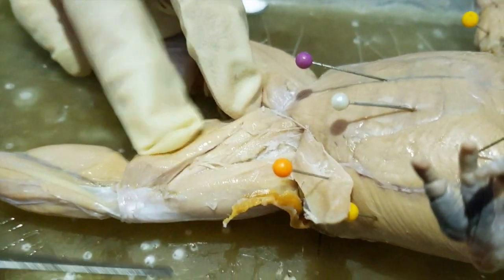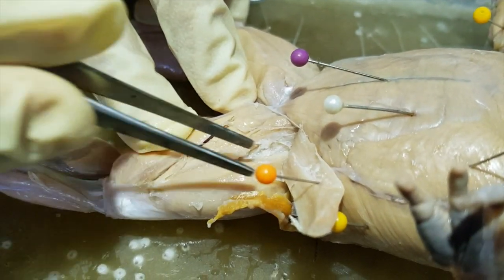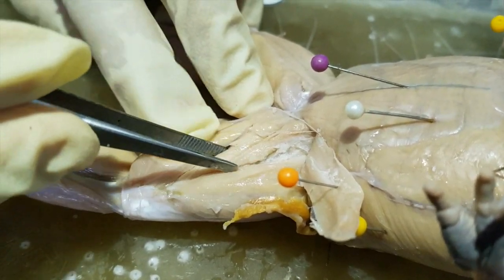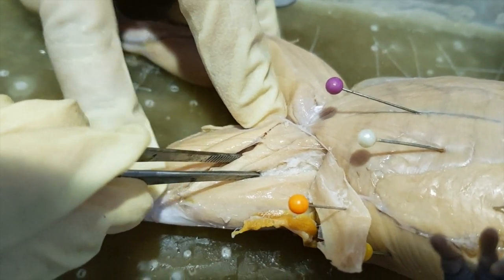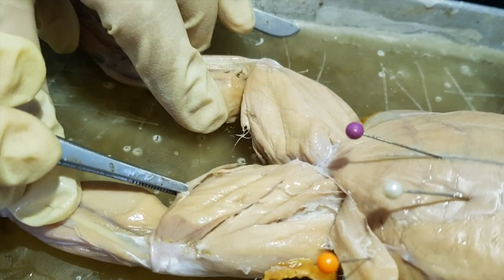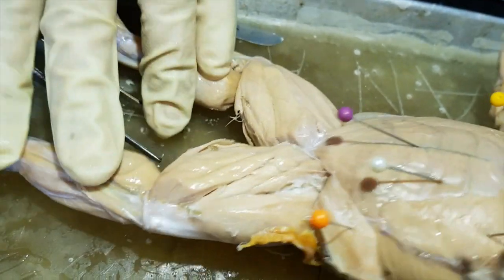Okay. So the underlying muscle includes now this big muscle here, the adductor longus. Longus because it's long. This is actually a bigger muscle also, the adductor magnus. Then this is the gracilis major with the gracilis minor found on the inner thigh.